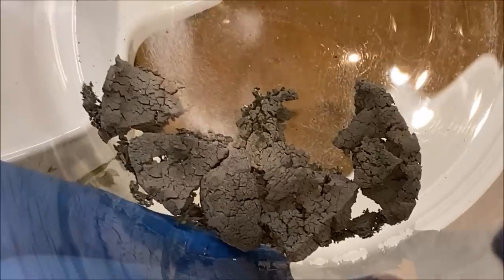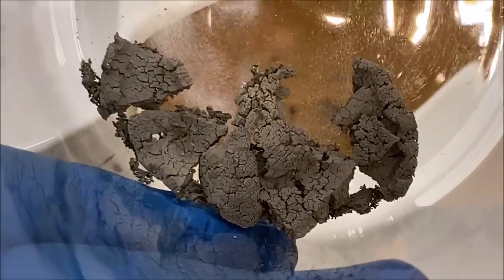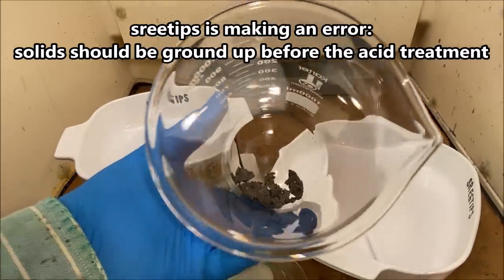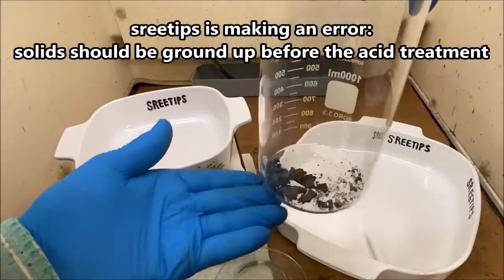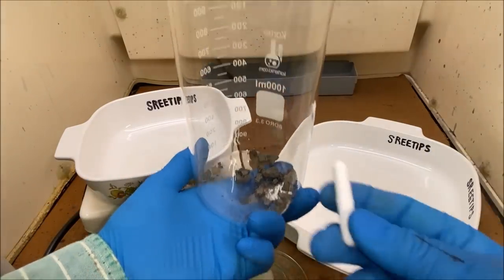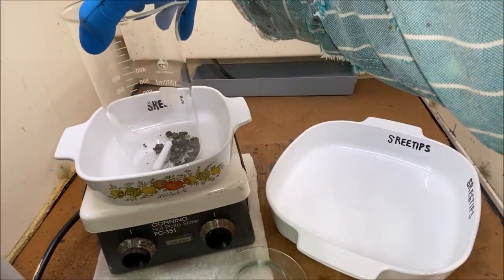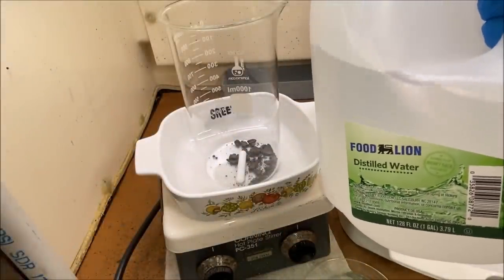Colored material. That should be our precious metals. Got it all cleaned up and concentrated now. Oh yeah, it's quite hard. I think we can go ahead and put a stir bar in here. I'm going to set it up on our stir plate. I'm going to pour in a little bit of distilled water.